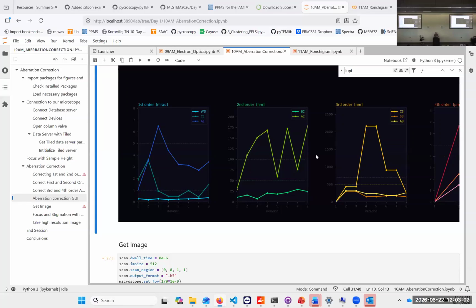So if you do that with about 75%, you will go down much more quickly. So don't trust it only to about three quarters.